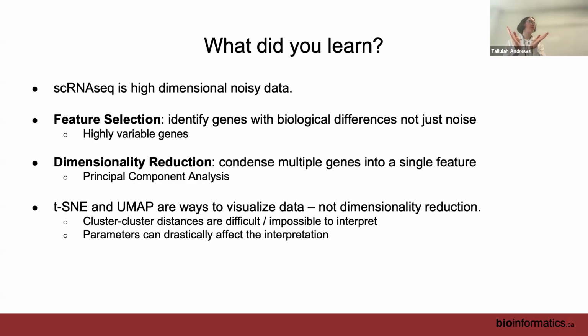It also made it much better because its first guess is actually pretty good. It's capturing the major signal in the data. Whereas t-SNE's approach of just randomly throwing the dots wherever on 2 dimensions was not very reproducible. Each time you ran it, the initial state would be very different, and it doesn't really reflect the data at all. So it would have a harder time getting a good visualization than UMAP did.